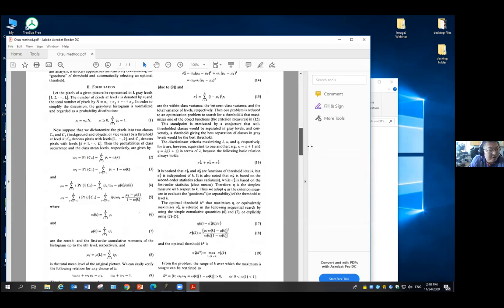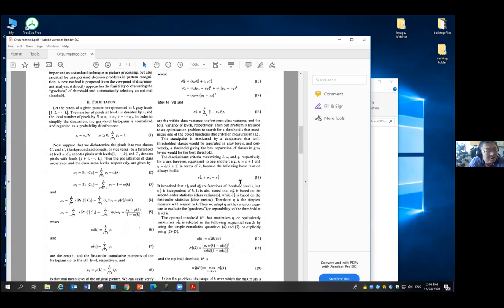But in our case, the good thing for us is we don't need to actually understand how it works. We only know some smart people figured it out. And what we only need to do is try to see if it works for my sample. If it works, we'll just use it.